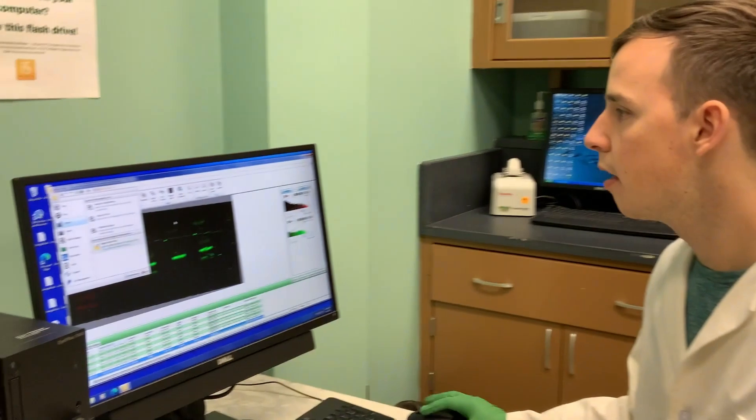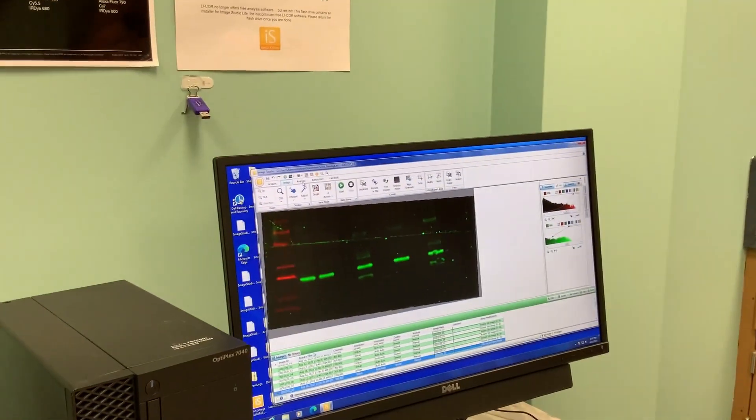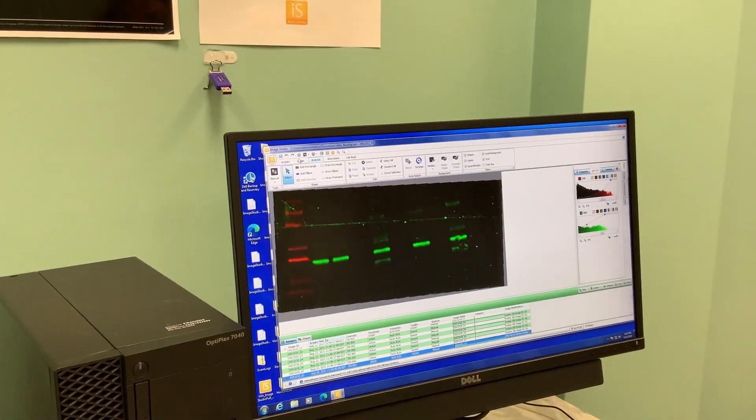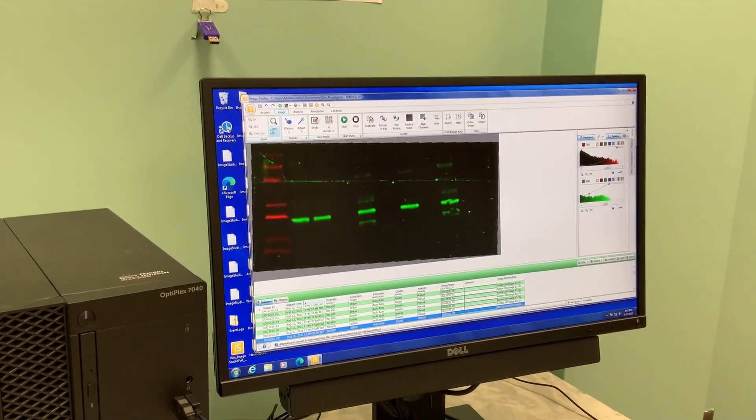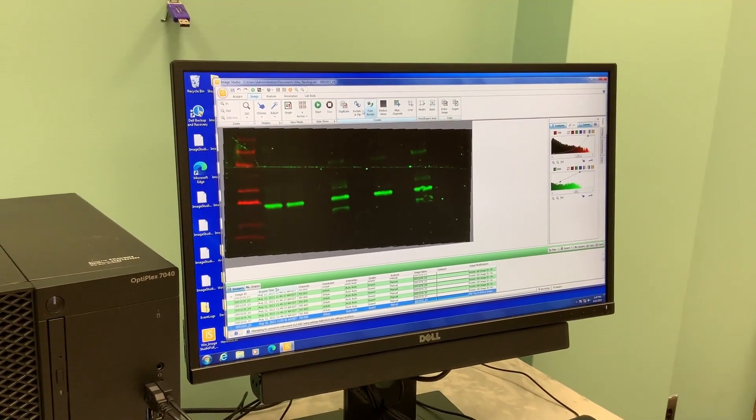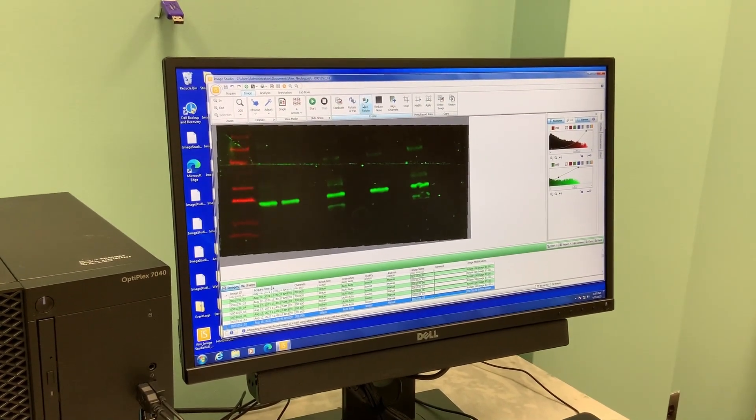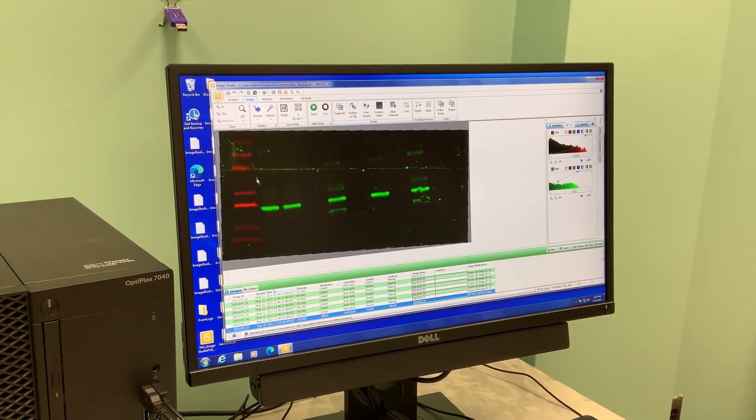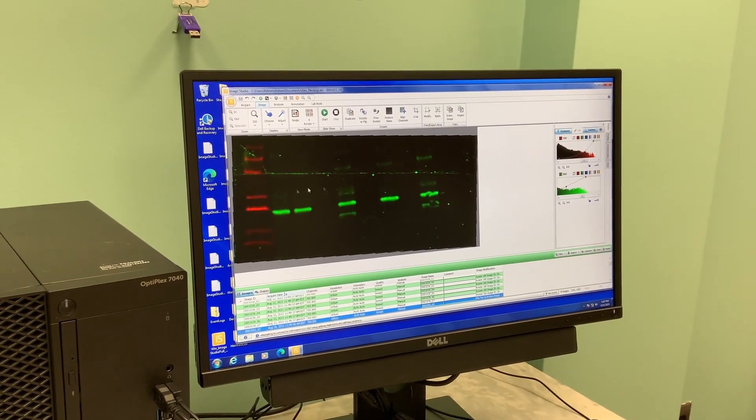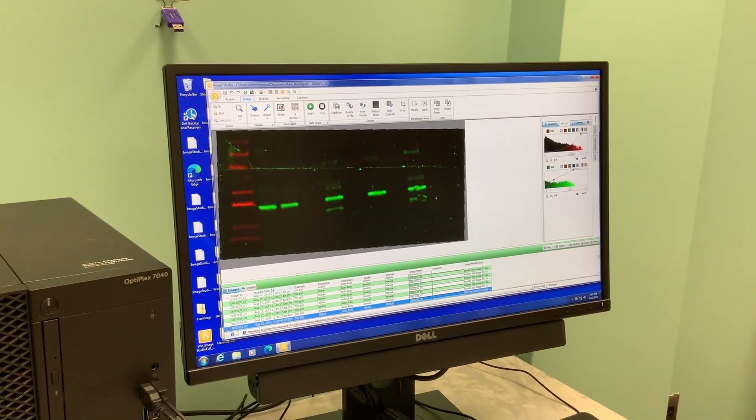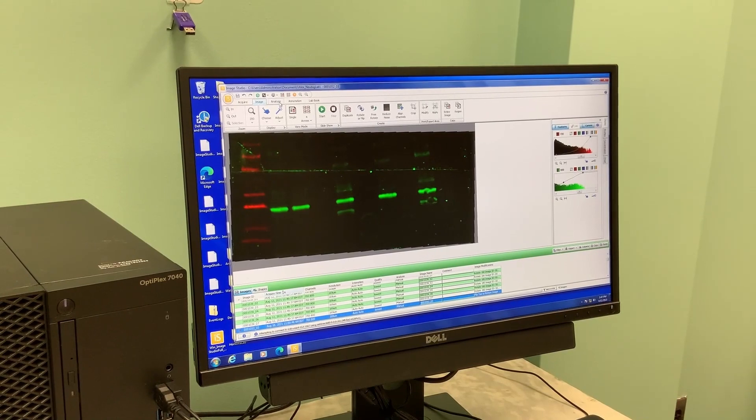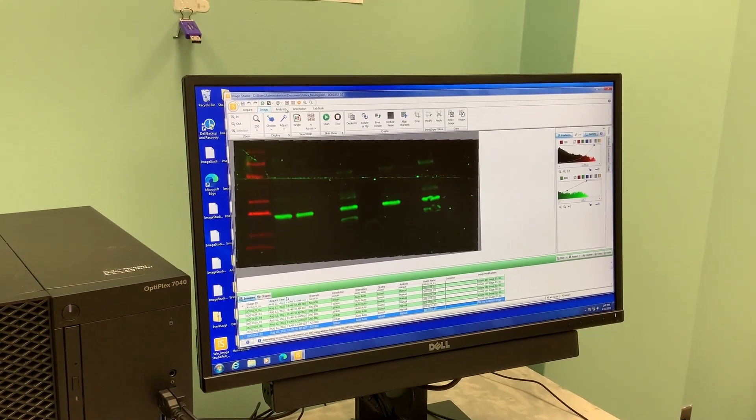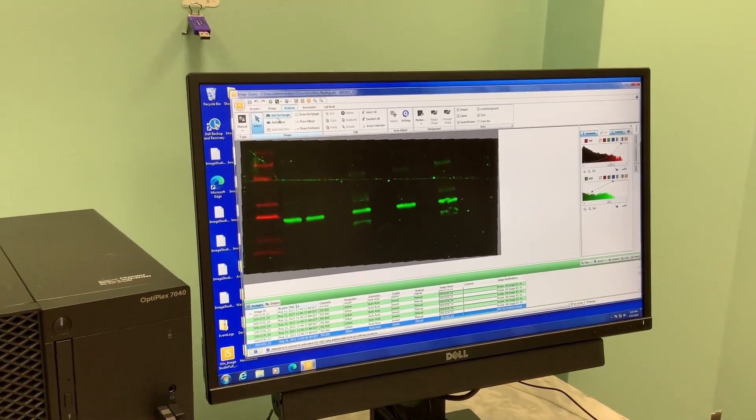I'll just note there's also this Analysis tab. In the Image tab there's a ton of different transformations. You can rotate your blot. Often you may need to flip it if you didn't put it on the scanner the right way.